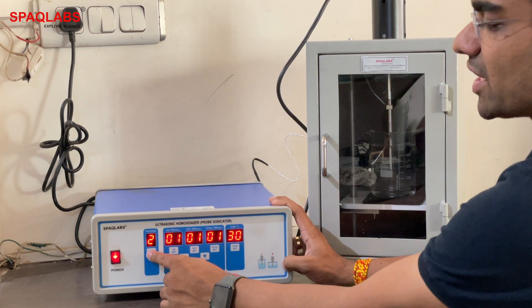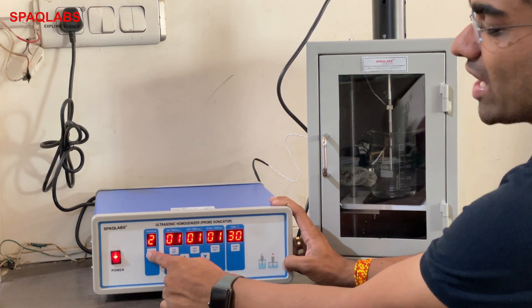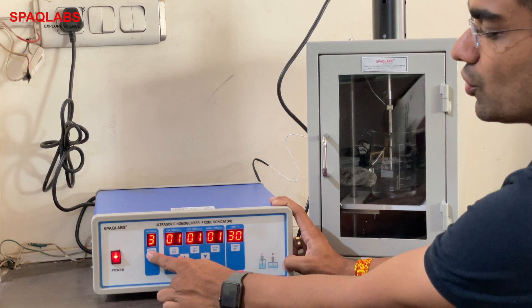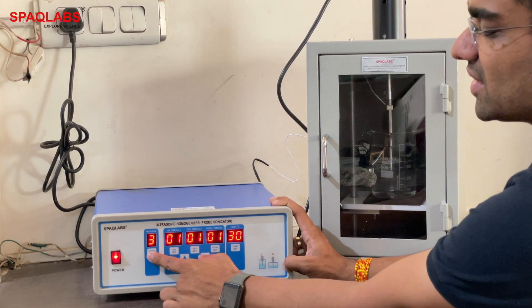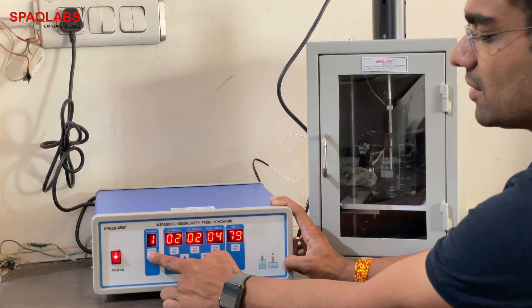Pressing again selects the second program, pressing again gives the third, fourth, and so on up to the sixth. Right now we will set one program and see how to program it — starting with the first program.